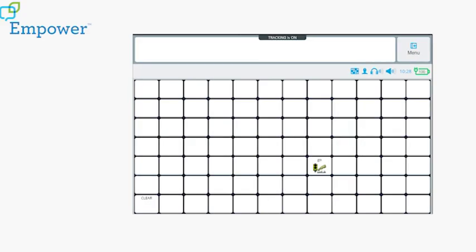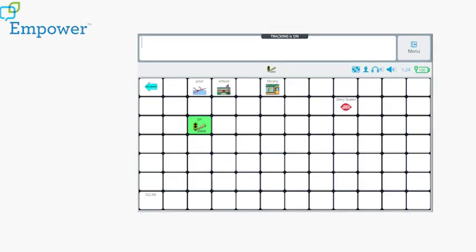Now we can see when I select the symbol for go, I have successfully added the word Dairy Queen.